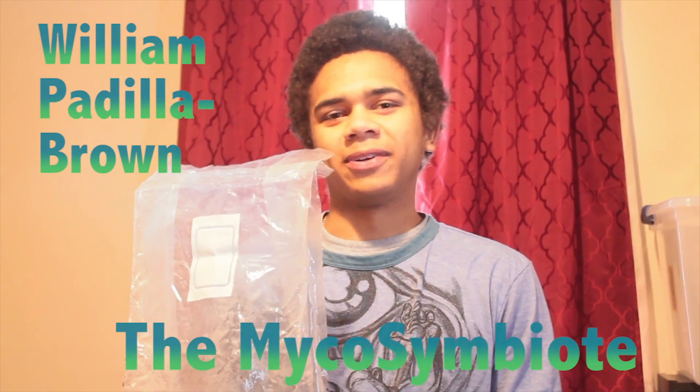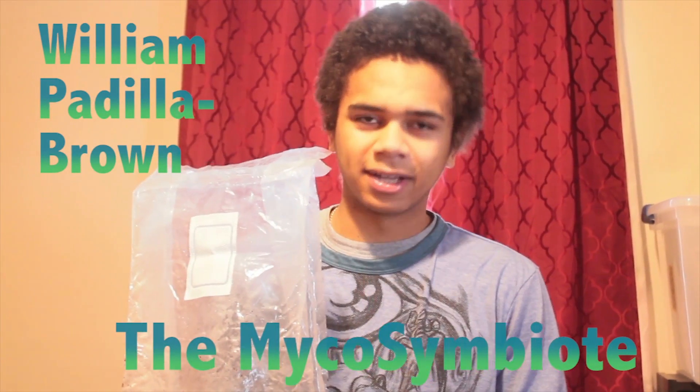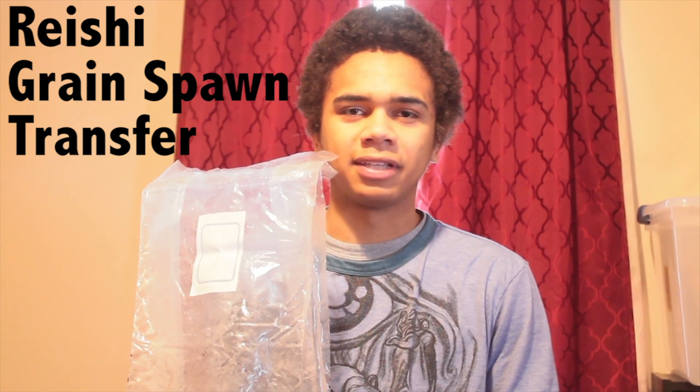Hey everybody, it's the MycoSynBiote. My name is William Petia Brown and today we're just going to do a demonstration on how to inoculate grain spawn into a bigger bag of media.